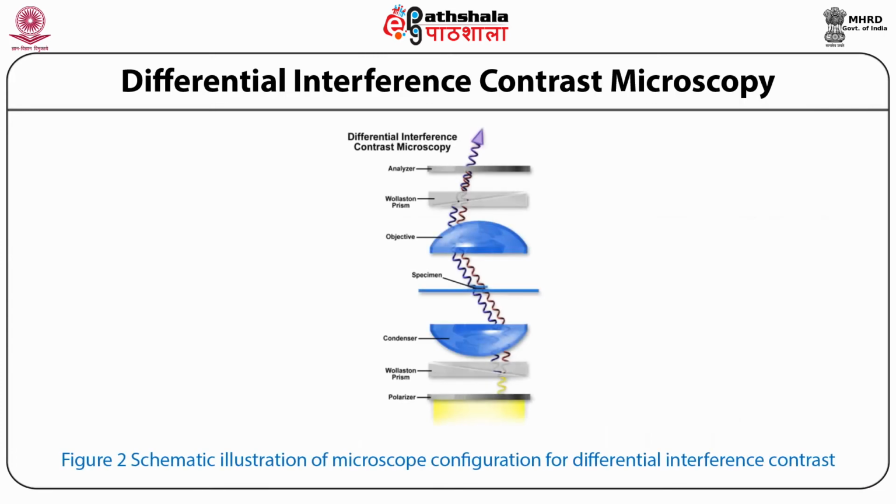Figure 2 shows the schematic illustration of the microscope configuration for differential interference contrast.